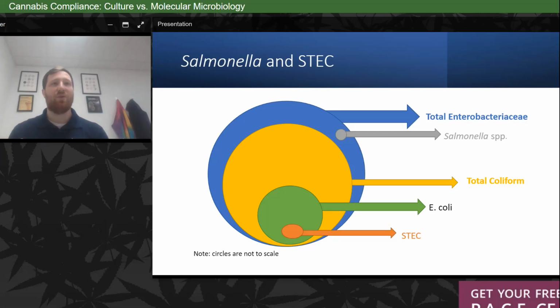Especially when we're looking at the regulations, and at how these different microorganisms not only live but how they will affect us when we're testing them. For instance, Nevada has an Enterobacteriaceae (EB) test and a total coliform threshold test. More often than not, those tests will show similar organisms.